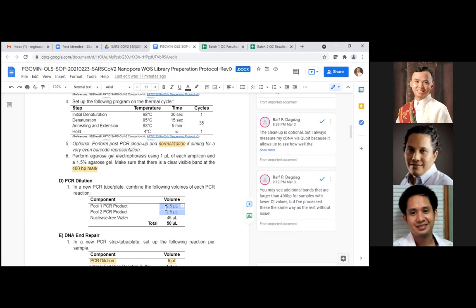So for a very crisp band, we only use 2.5 uL of PCR product per amplicon. And then for a clear band, but not so bright, we use 3 uL. And then faint band, we use 3.5. And then for smear with no band, we use 4 uL. And we were able to get good results from that, but we were not able to sequence successfully everything.